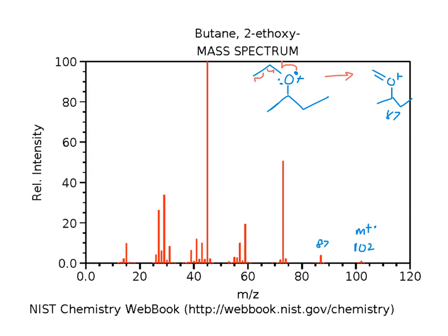All right, we can do the same thing, but go in the other direction. That methyl group, we just didn't show because it's not going to show up, right? So it would be a loss of a methyl radical. The radical doesn't show up. Right, we only see the cations. Okay, we could also lose this methyl group, right? Just pushing it the same way, and cleave this methyl group. Or we could lose this ethyl group.